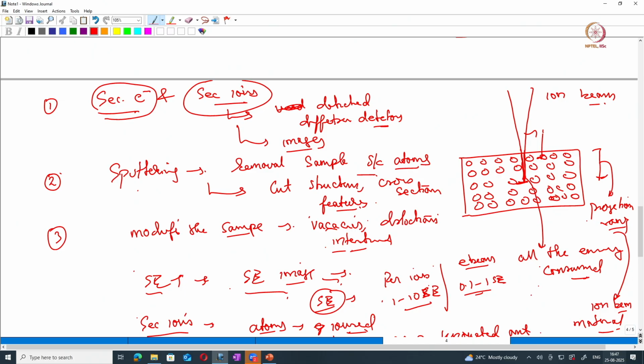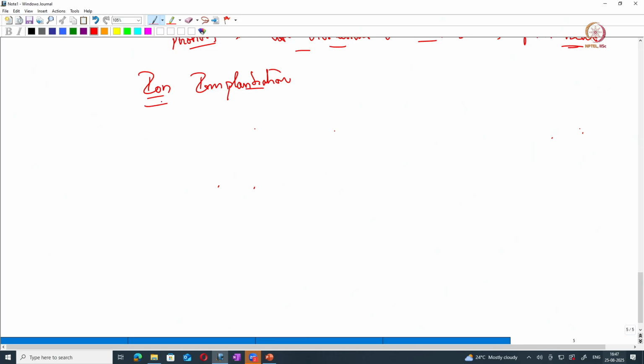During the interaction of the gallium with the sample, we also encounter an issue which is called ion implantation. As I told you before, if you have a sample surface and a gallium FIB, the gallium ions are accelerated towards the sample surface. This is your cross section.